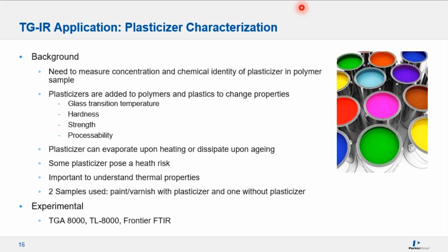So if you ever get inside of a new car and you smell that nice new car smell, that's actually plasticizers from all the plastics and fabrics inside the car being off-gassed. So some of these plasticizers can pose a health risk. So understanding thermal properties and the off-gassing behavior of these plasticizers is important.